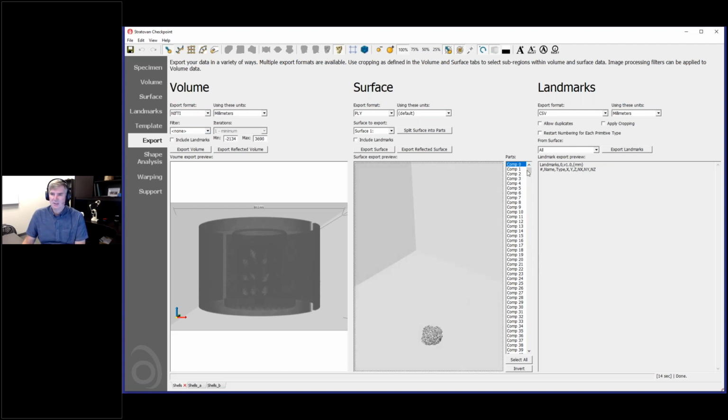So now it's split this into multiple components, and you can click through these. These are sorted based upon the size of the component. So up here we have large things, down here we have little tiny things, which I don't even know where that is. It's so small. It's some really small thing. So the larger things are at the top, and then you can use the arrow keys to move down this list.